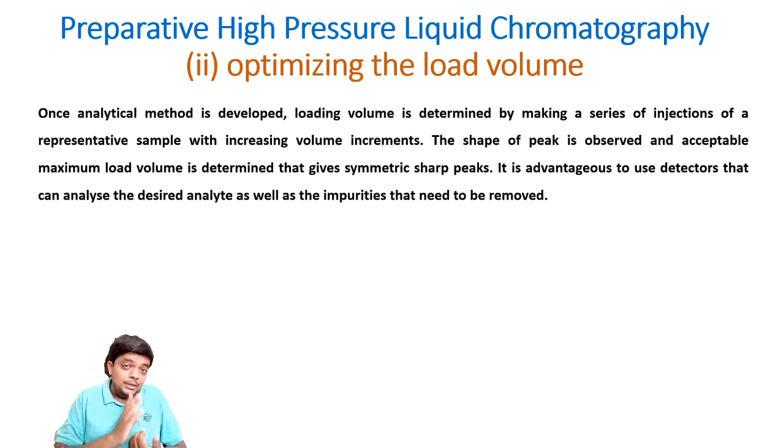The shape of the peak is observed and the acceptable maximum load volume is determined, that gives a symmetric sharp peak. It is advantageous to use detectors that can analyze the desired analyte as well as the impurities that need to be removed. This is important.